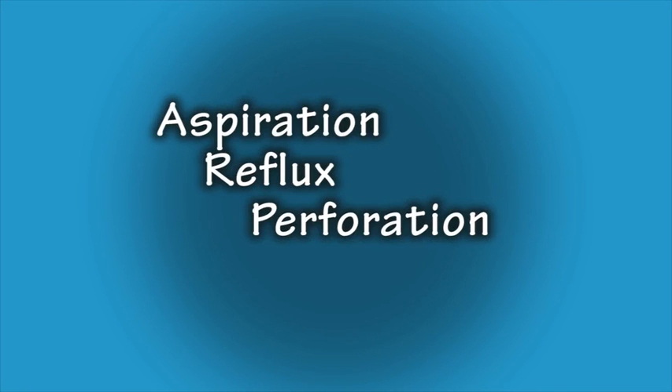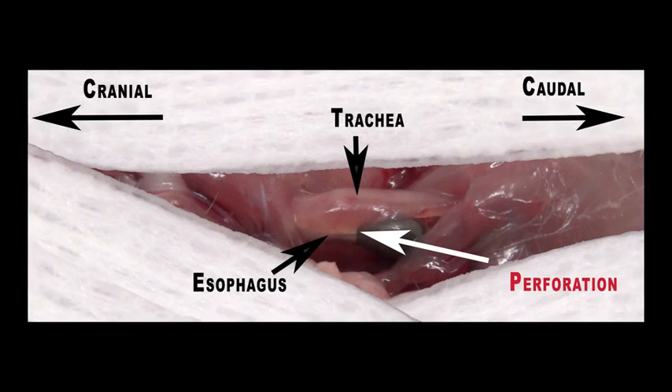Complications from any gavaging procedure include the chance of aspiration, reflux, or perforation of the stomach or esophagus. In order to minimize aspiration complications, a technician gavaging for the first time should practice with a small amount of saline, because even if this is aspirated, a small amount of saline can be absorbed by the lungs. Here you can see perforation from a metal tube. This perforation is much less likely to occur with a plastic feeding tube.